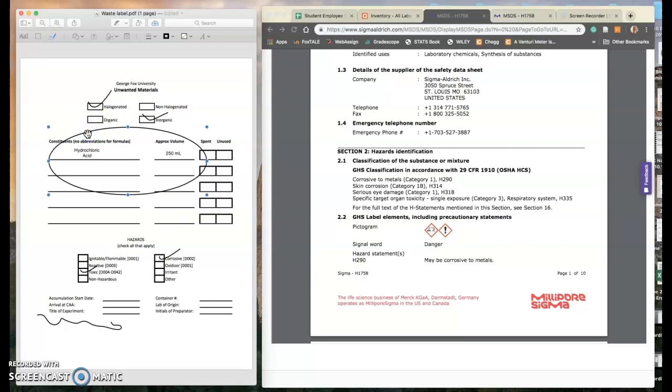Make sure that no matter what you're doing, you never leave bottles unlabeled, and it's always a good rule of thumb to label the bottle before you pour or mix your chemicals in it. That way, if anything happens, we're not left with an unknown liquid. That's probably the number one thing we don't want happening in the labs when it comes to any sort of chemical storage.